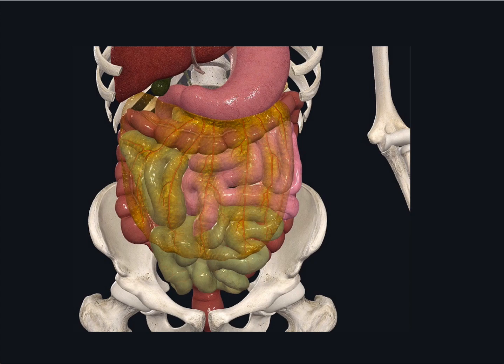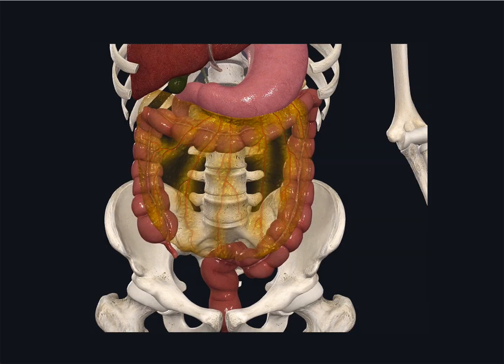I will show you the mucosa of part of the small intestine, more specifically the ileum, indicated here in light green, where the secondary lymph nodules are called Peyer's patches. And if I remove the ileum, it will indicate to you the vermiform appendix arising from the cecum. And I'll show you masses of lymphoid tissue dominating both the mucosa and the submucosa of the appendix.